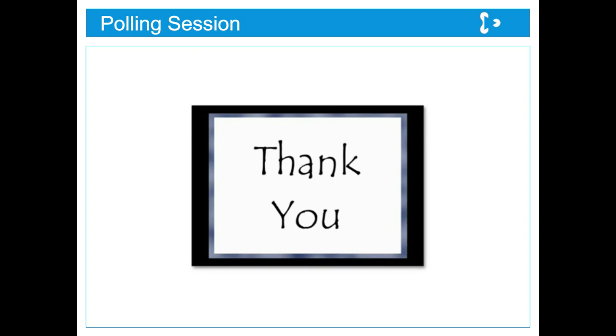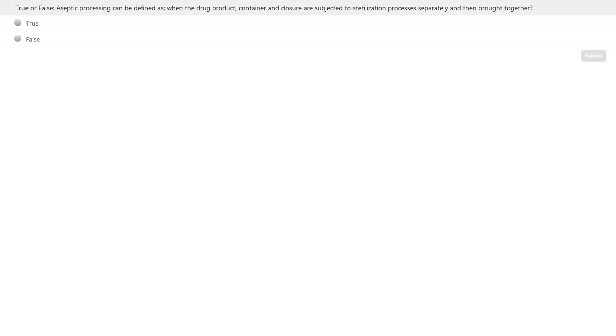Great. Thank you, Jeff. So as Jeff just mentioned, before we bring on the next speaker, we're going to have three quick polling questions. The first is a true or false question. Aseptic processing can be defined as when the drug product, container, and closure are subjected to sterilization processes separately and then brought together. Is that a true statement or a false statement? We're going to leave this up for just half a minute to a minute to allow the results to come in. If you could please just check true or false.